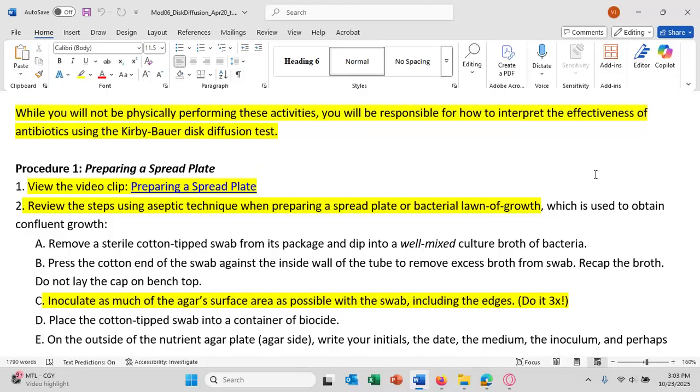Because there are very large areas of the plate that have no growth on it. And I said, well, you didn't swab the plate correctly. You're supposed to get a lawn of bacteria. And I told her she had to repeat the experiment, or she could use her lab partner's results because her lab partner swabbed the plate correctly.